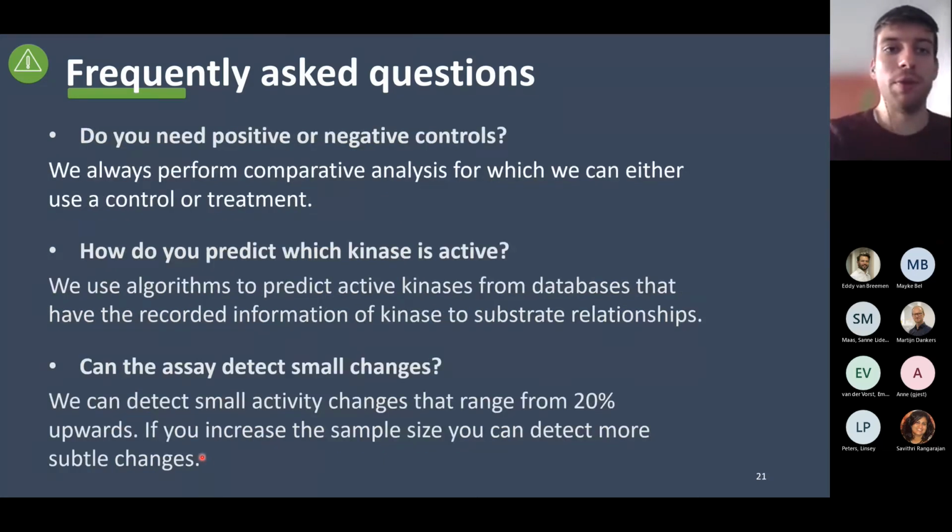We are frequently asked if you need positive or negative controls in the assay. Because of the way that we do our analysis, we really compare between a control and a treatment assay. So in this case, the controls are already included.